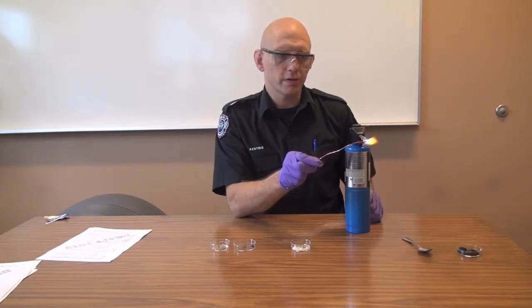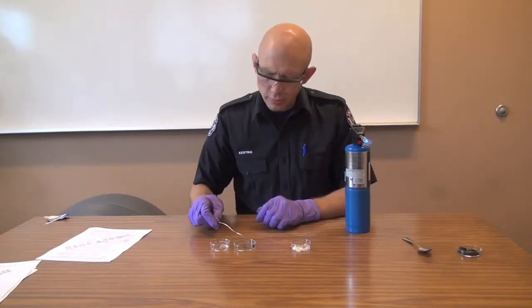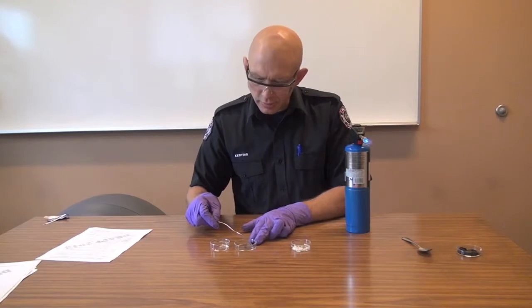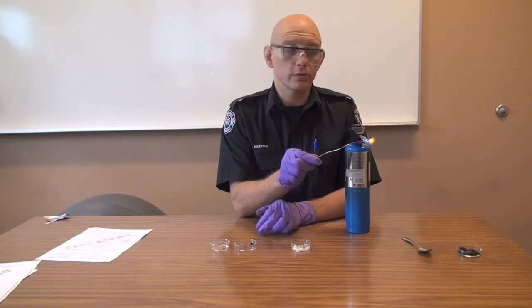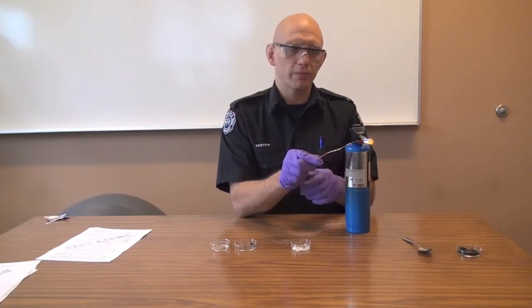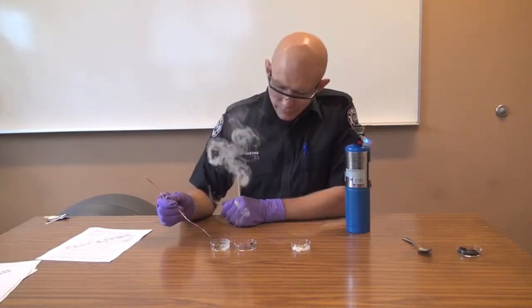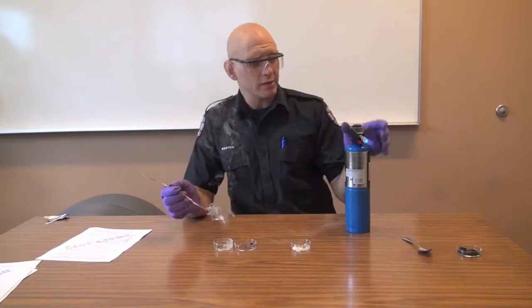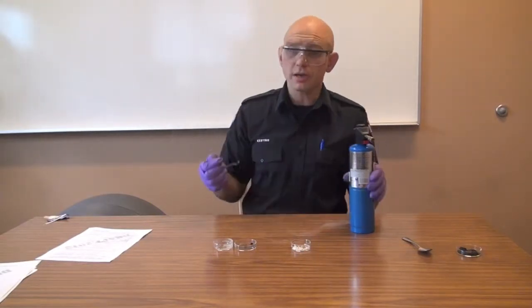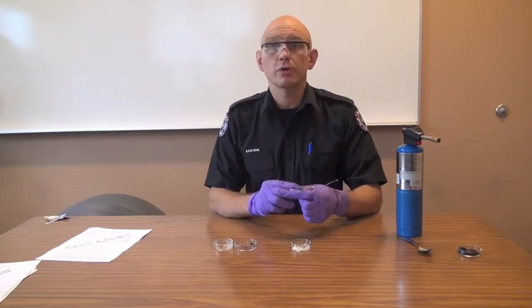It takes a little bit of judgment to figure out how much reactivity is bad reactivity. I'm looking at it bright red hot. I'm going to touch it to my black sample here — nothing. No reaction at all. So that means we can continue with the test. If it had popped or exploded, then we wouldn't have continued. With the ammonium nitrate, I'm getting a little bit of steam coming off because there's some residual moisture, but it didn't actually go pop. It didn't actually explode or react. That means I'm good to proceed to the hot tube test.